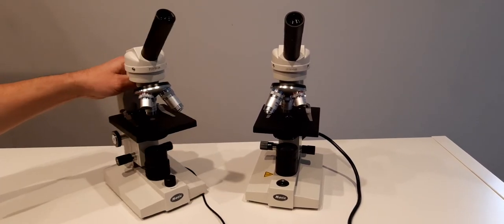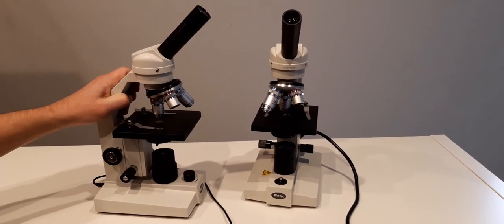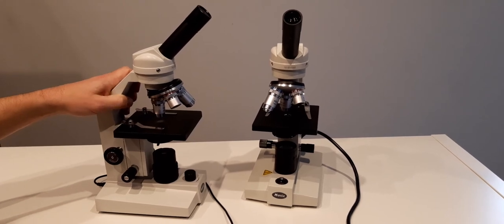The robust metal construction makes it ideal for years of classroom use.